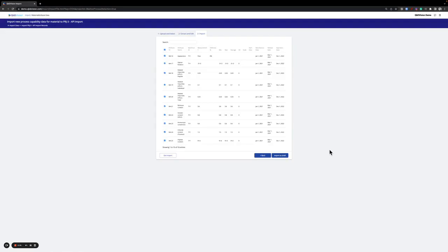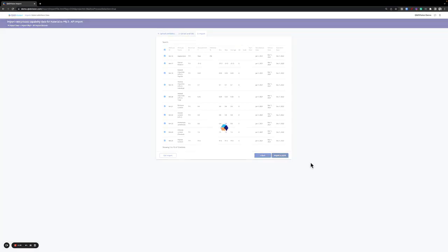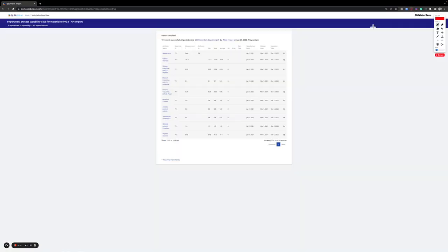After reviewing your information, you will get the final confirmation before the system uploads the C of A into your various draft records. Import as draft. Your import is complete. And just like that, your C of A record goes from a paper in a filing cabinet or a file in an email to a digital record that is in draft format.